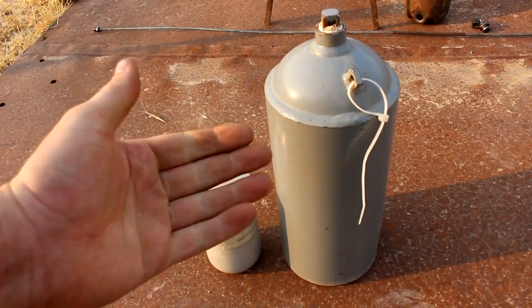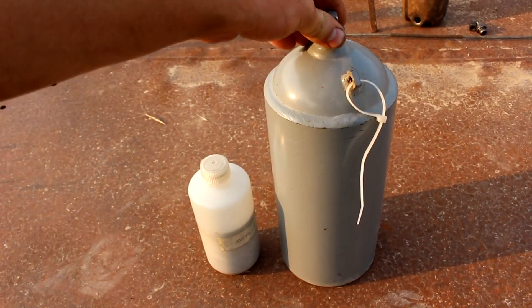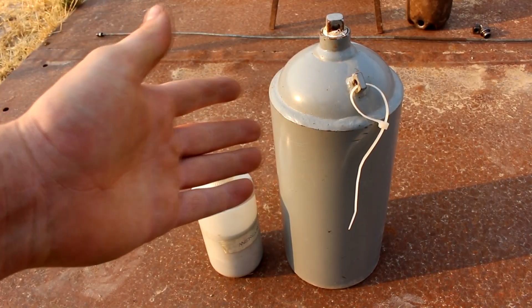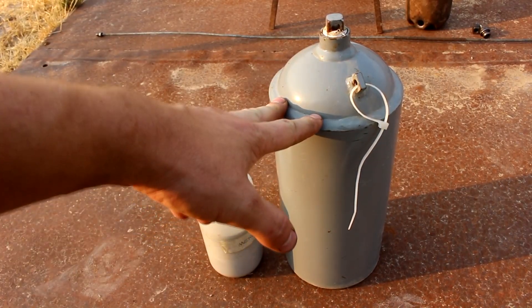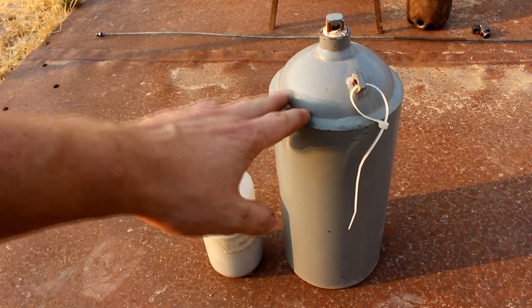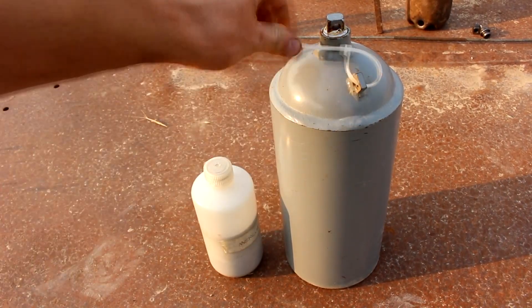Hi everyone, welcome back to Cody's Lab. As you may know from my flushing mercury video, I've got a lot of mercury that I need to get distilled. I've got three flasks contaminated with gold, but that's not top of my priorities. A few parts per million gold really isn't that bad. As long as the mercury is shiny and I've got some that isn't contaminated with gold, I'm perfectly happy using it as is.